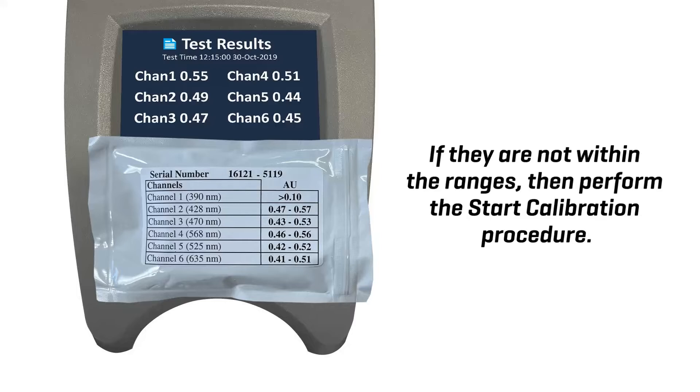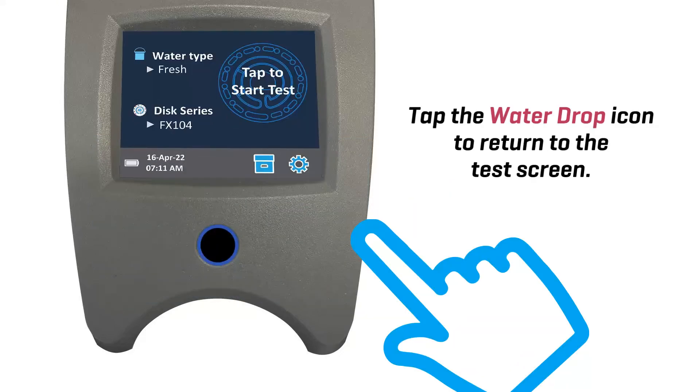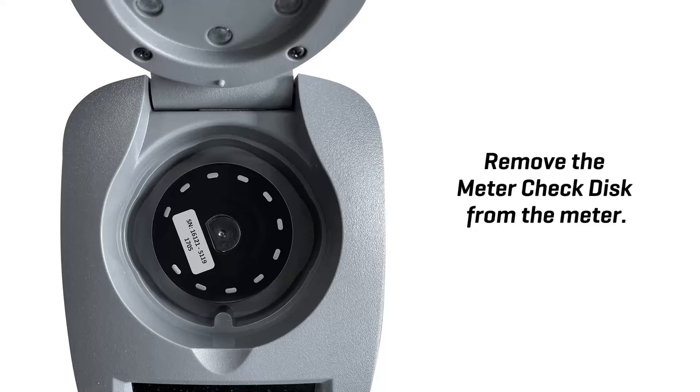If they are not within the ranges, then perform the start calibration procedure. Tap the water drop icon to return to the test screen. Remove the meter check disk from the meter.